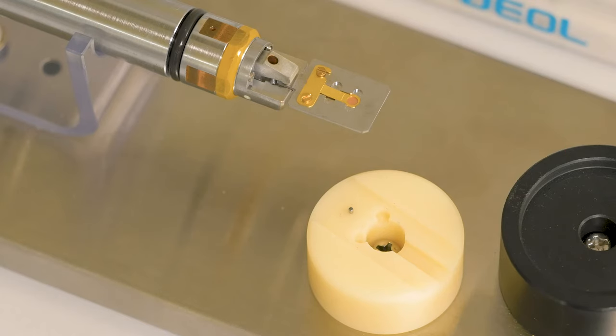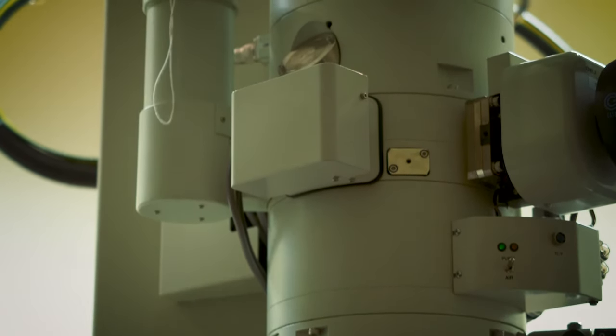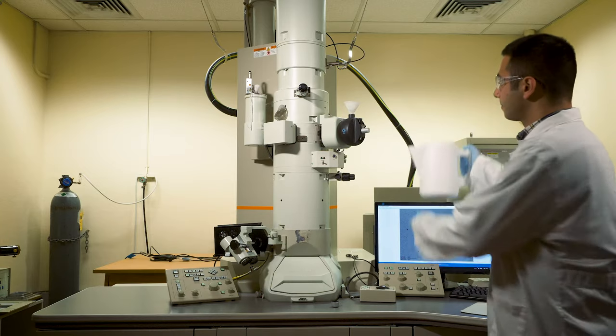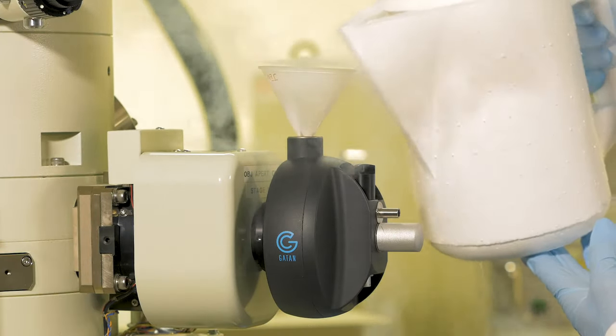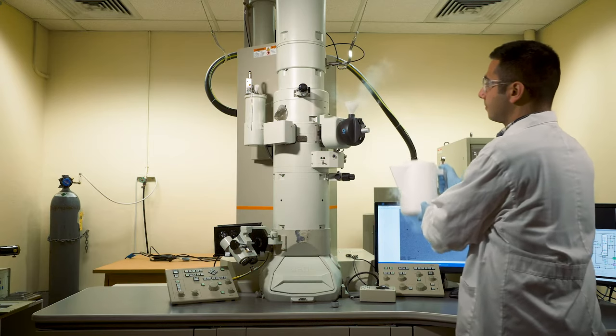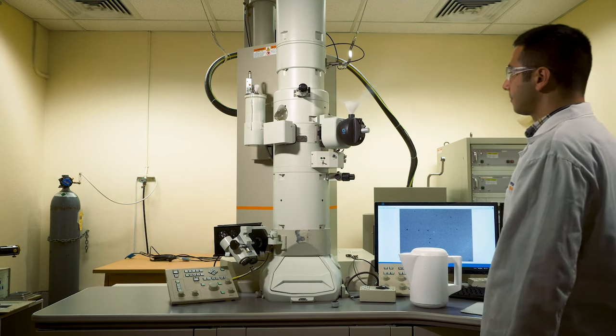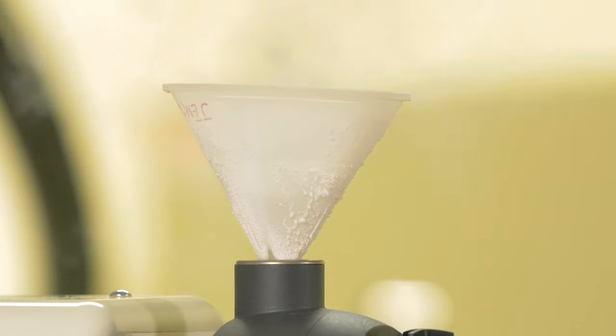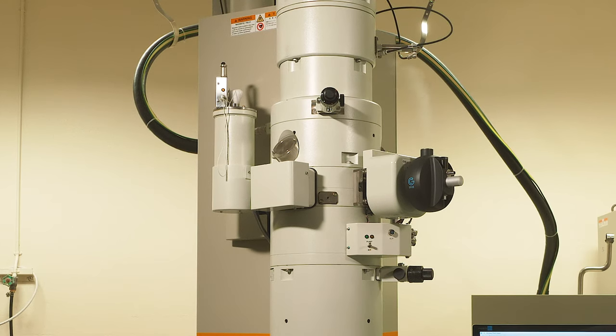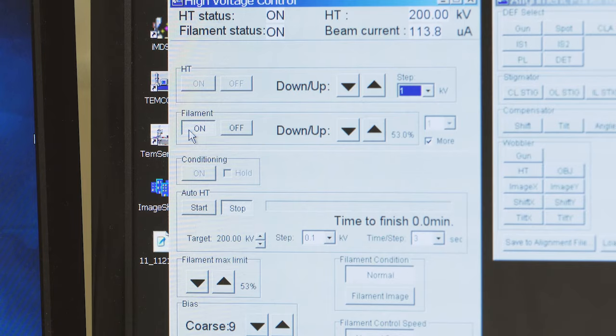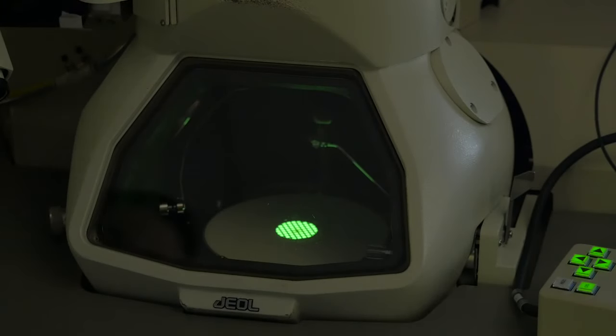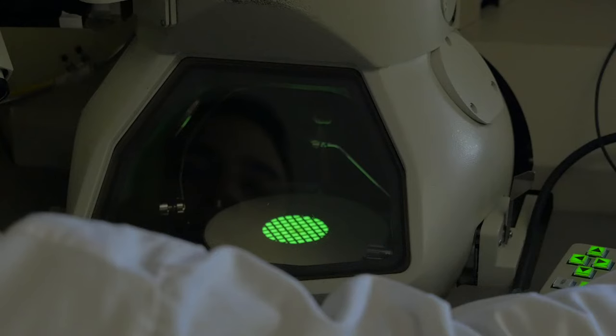Then, the sample is placed in the TEM machine and we wait to pump down and achieve the proper pressure and vacuum. We need to fill the sample holder with liquid nitrogen which helps minimize contamination and improve the vacuum and recovery time from specimen insertion. Also, freezing the samples prevents them from evaporating in the vacuum of the electron microscope. In addition, the low temperature will also protect the sample from damaging interactions with electrons used to image the sample. Now, we are turning on the filament to generate the beam and expose to the sample. It takes a minute to warm up. Then, we need to align the beam on our sample which makes us able to see our particles very clearly. Sometimes, this can take a long time.